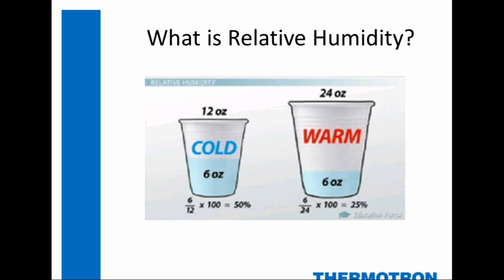A couple of other points I want to make when it comes to humidity testing in chamber. When you're testing a product that gives off a lot of heat, special considerations are required. It's very difficult to test humidity conditions with a lot of live load. If you need to control both temperature and humidity at the same time, that would normally be done in a steady state condition. If you see test specifications that require the changing of humidity or the changing of temperature and humidity at the same time, the key to doing that successfully is doing it very slowly.